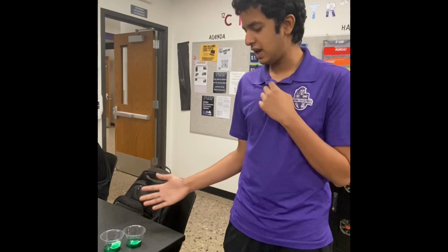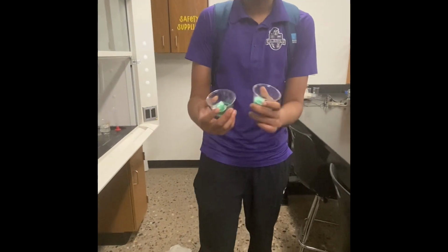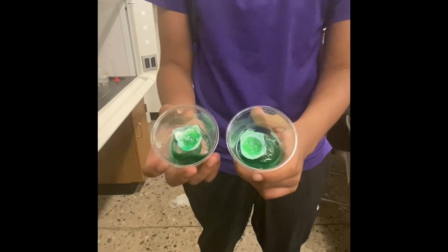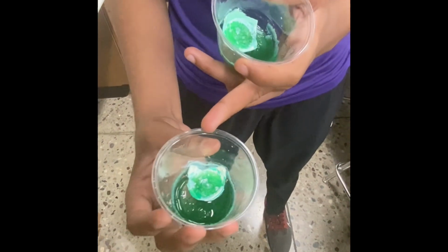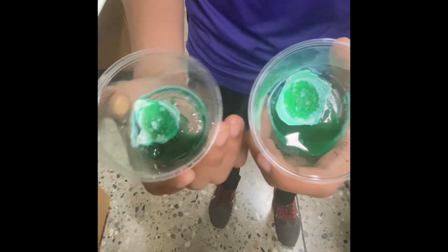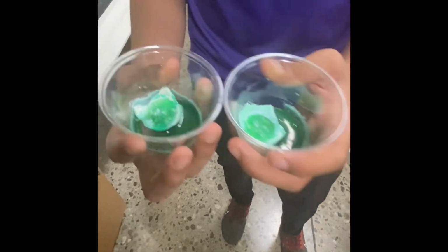It's something simple that anyone can do, and after letting the egg geodes rest a couple days, we can see our final product here. Although we don't get really big crystals, we still did a good job of looking at the crystal solution, and there's not a lot of excess liquid. So I would say this project is a success and a very simple one for AP chemistry students.